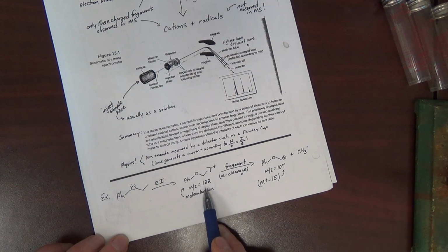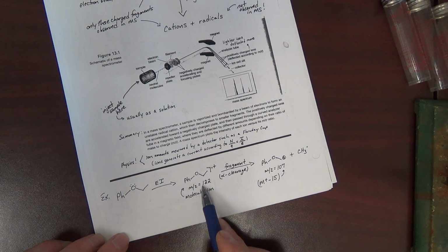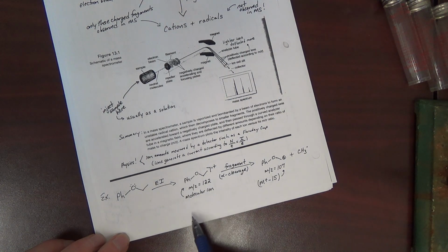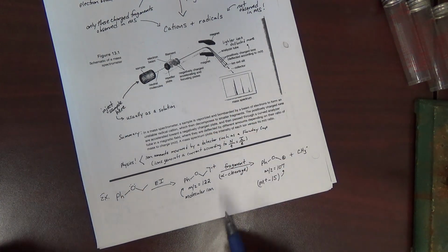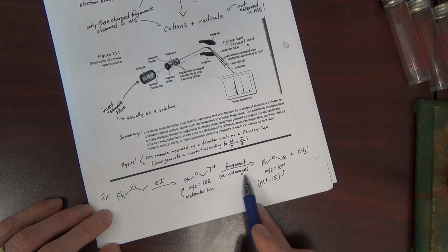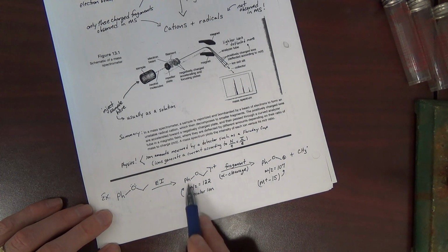The mass of this is 122. That's actually the same mass as that because when you lose an electron, your mass doesn't change. Your whole mass, your nominal mass. This is called our molecular ion because it's the entire molecule. The molecular ion can then undergo fragmentation. One type of fragmentation we will learn is called alpha cleavage. It's common with ethers.